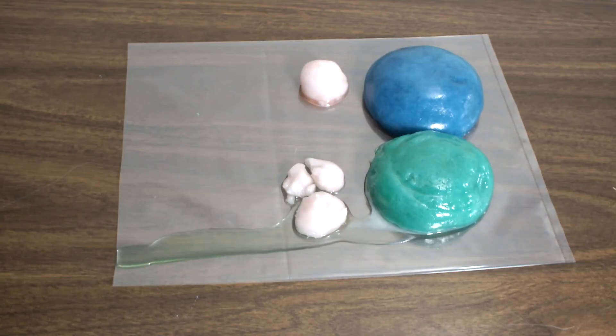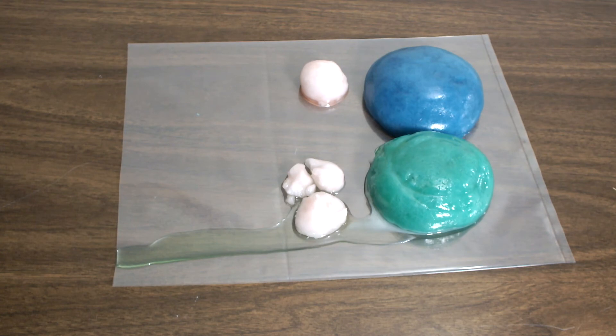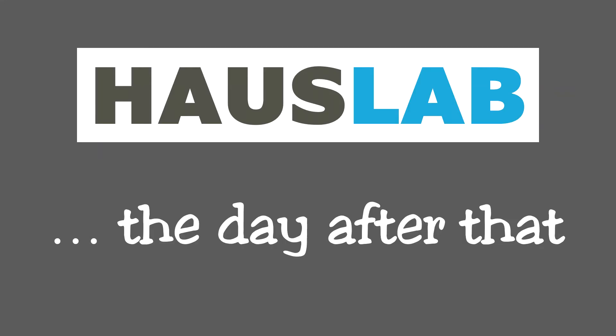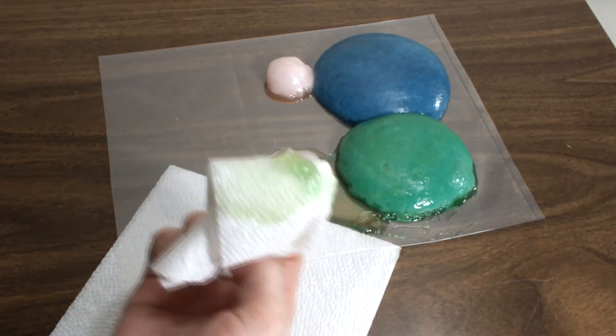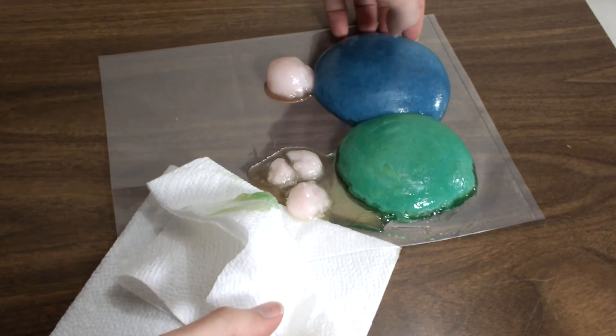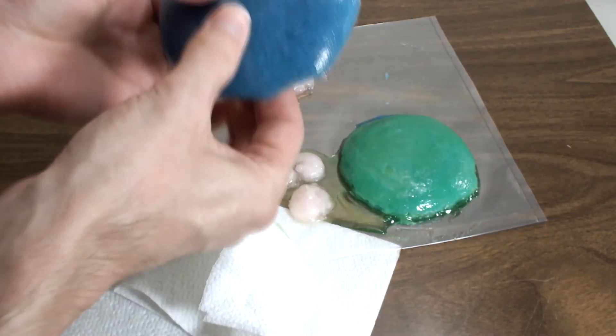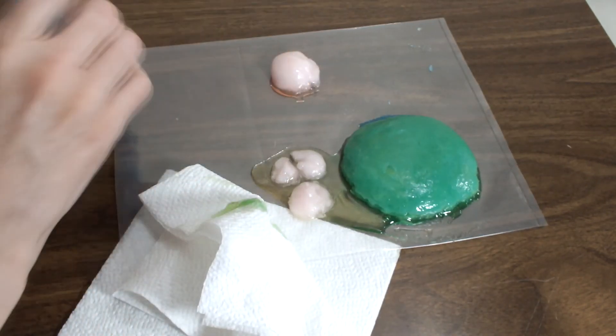Actually, that's not that. I found this the next morning. There was additional liquid loss from a few of the balls, and they have all slumped out of whatever round they may have been in. I guess that's what I meant when I said going towards gravity. It's a good thing I'm not a physicist. And now, they're pretty much flat. They have no more bounce. And they're a real mess. I'm gonna throw them all out.